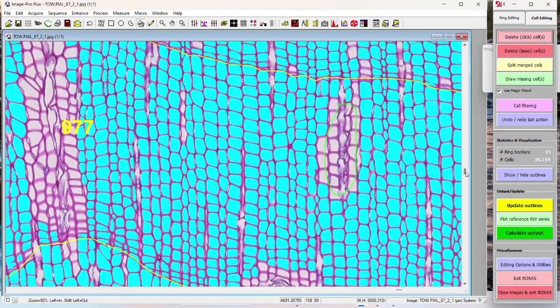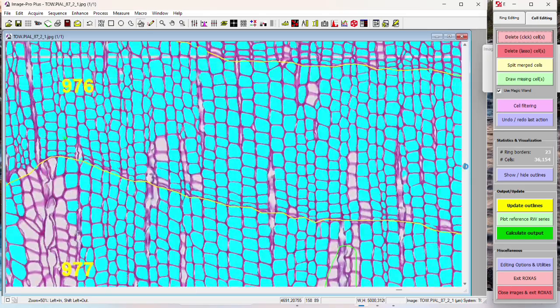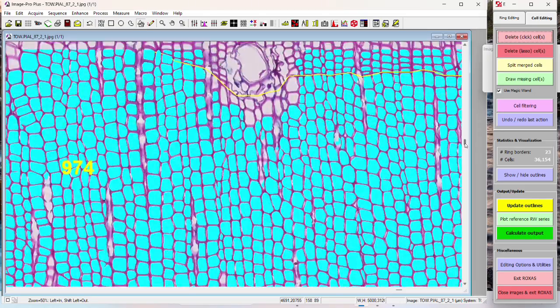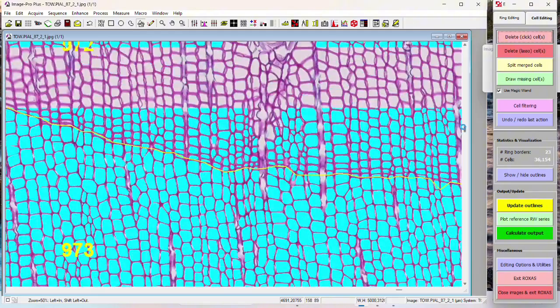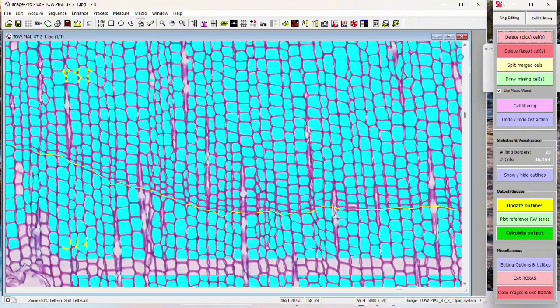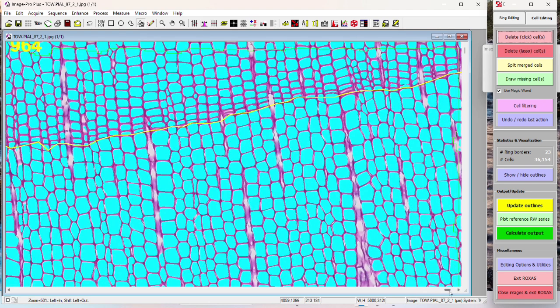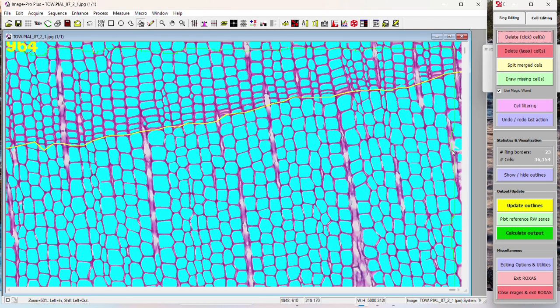So yeah, I'll go up looking for any kind of anomalies or incorrect selections. And then I'm going to go ahead and skip to the top. Once I get to the top, and actually I wasn't all the way in the corner apparently.